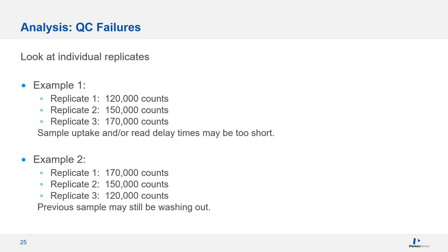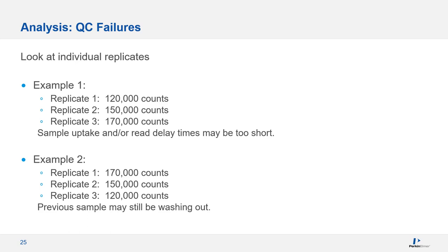Let's look at how individual replicates can be used to troubleshoot sample introduction or method timing issues. If the intensities are increasing with each replicate, this can indicate that you don't have a long enough sample uptake or read delay time. Example 2 shows replicate signals decreasing with time. This can indicate your sample washout time is too short, and the previous sample is still rinsing out when you begin making measurements for the next sample. When you see this, you'll want to check the concentration of the previous sample. Beware though, not all elements wash out at the same rate. Silver, tungsten, tantalum, molybdenum, uranium, those are all among particularly difficult to washout analytes. Depending on your setup, a 100 ppb standard of tungsten, tantalum, or molybdenum could take 20 minutes or more to return to baseline.